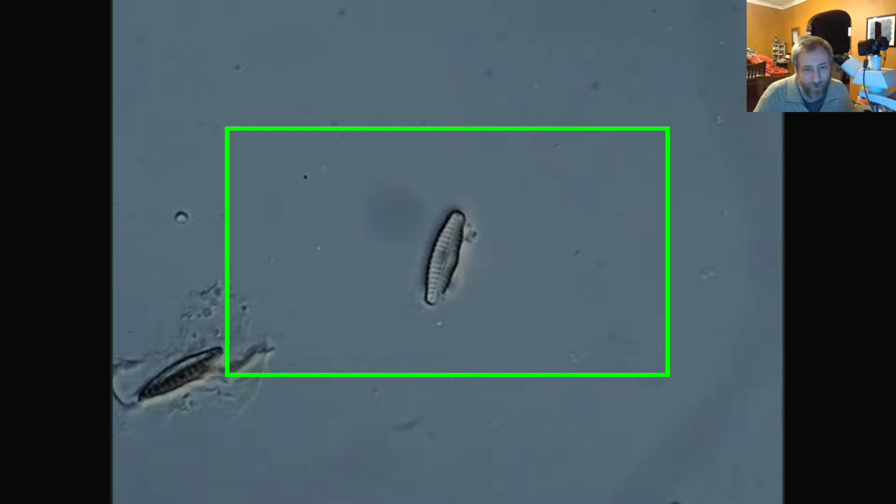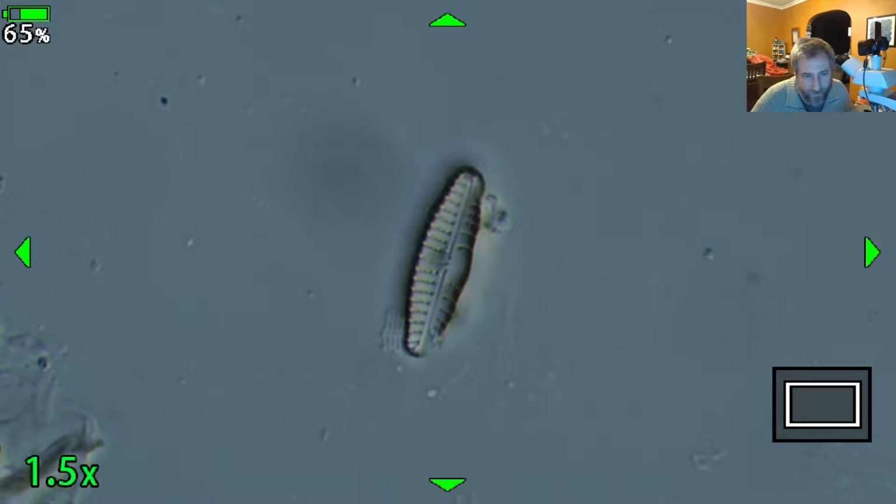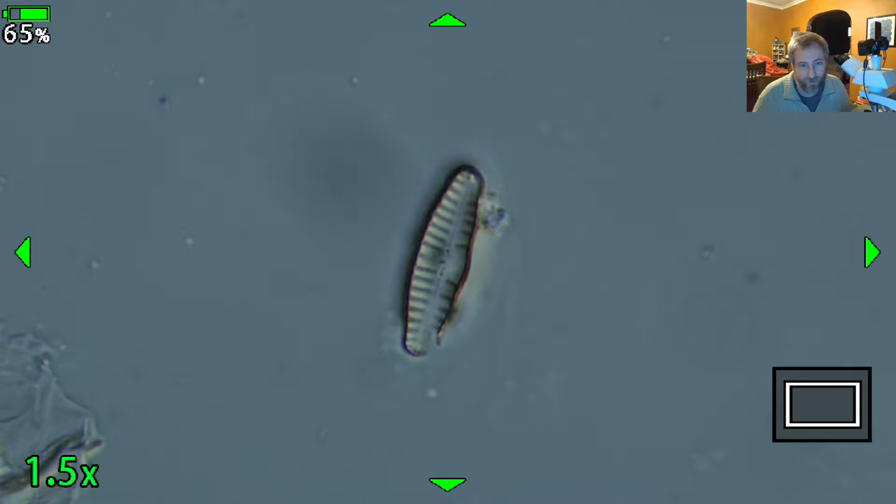It's got an asymmetric valve where if we look at the raphe, which is basically the line that runs down the middle of the axis of the diatom, you see it's got a lump on one side, and on the other side it basically looks like a comb, right? Only one side has a bump, and there's also some striae missing on the bottom. So I can zoom in so you can see what I'm talking about, right? You see that it has a raphe that runs through the middle of the valve down the axis, and then the two sides are different, they're asymmetric, and there's a bulge on the right side, and on the left side it's just like the top of a comb or something, right?